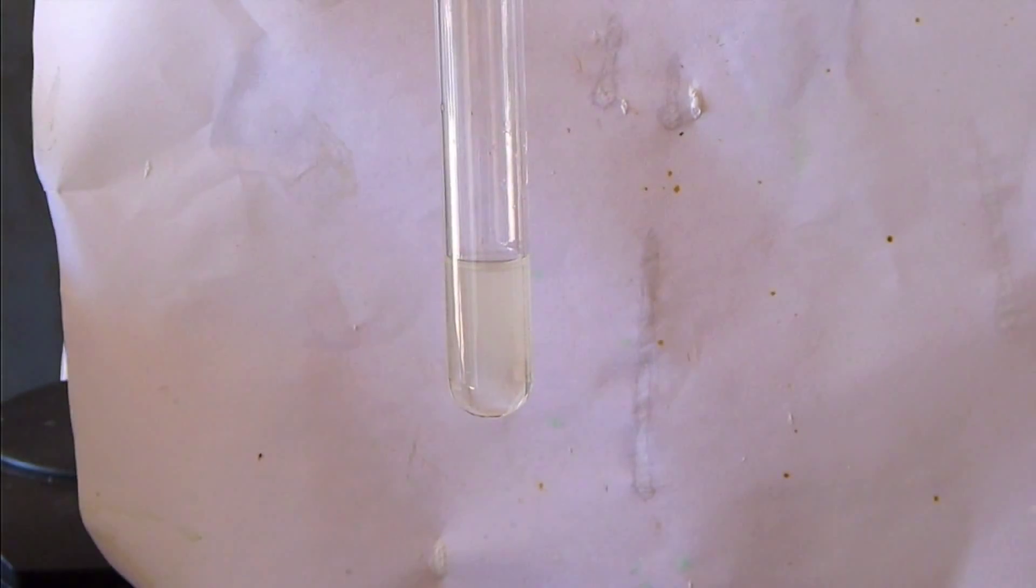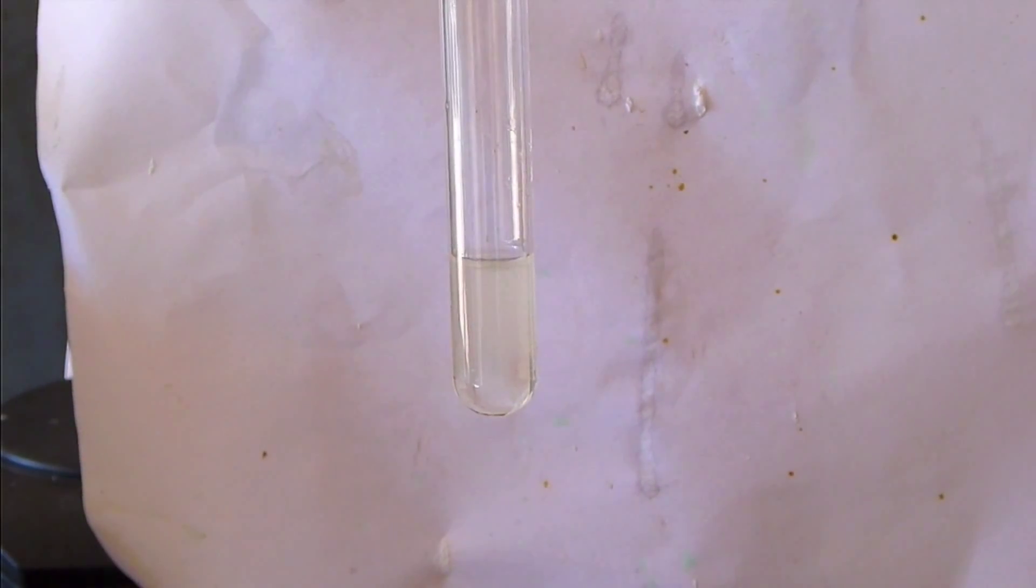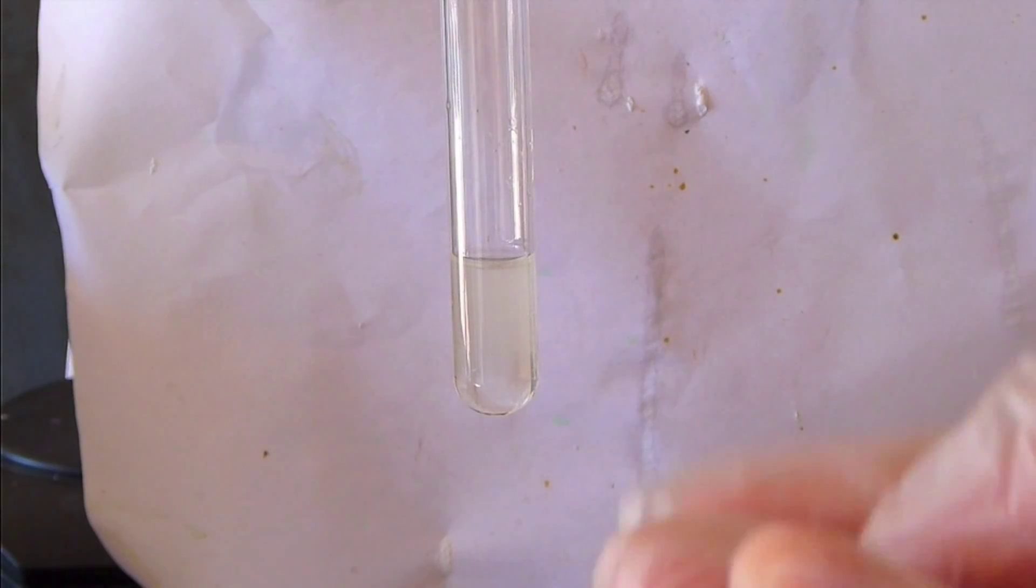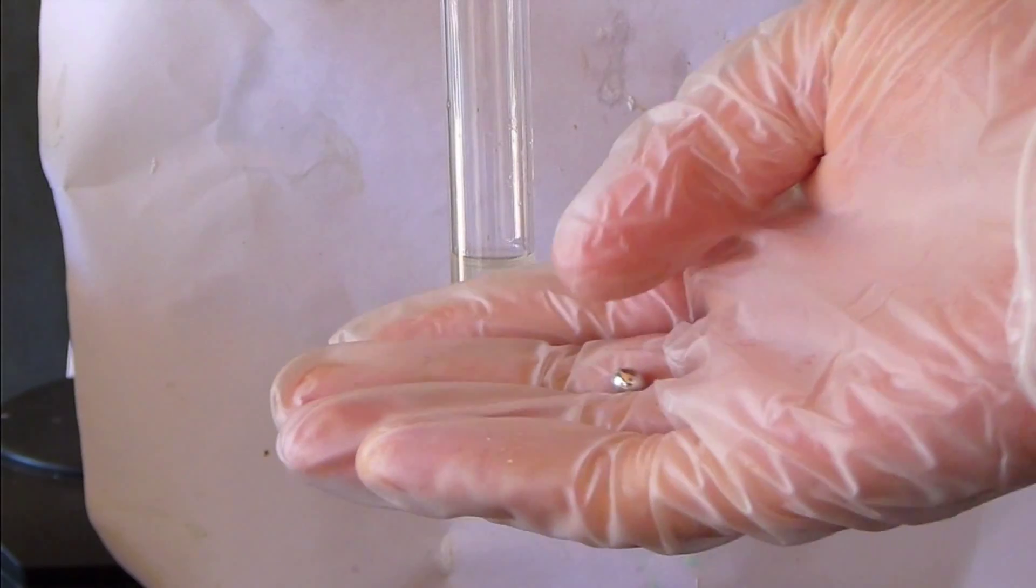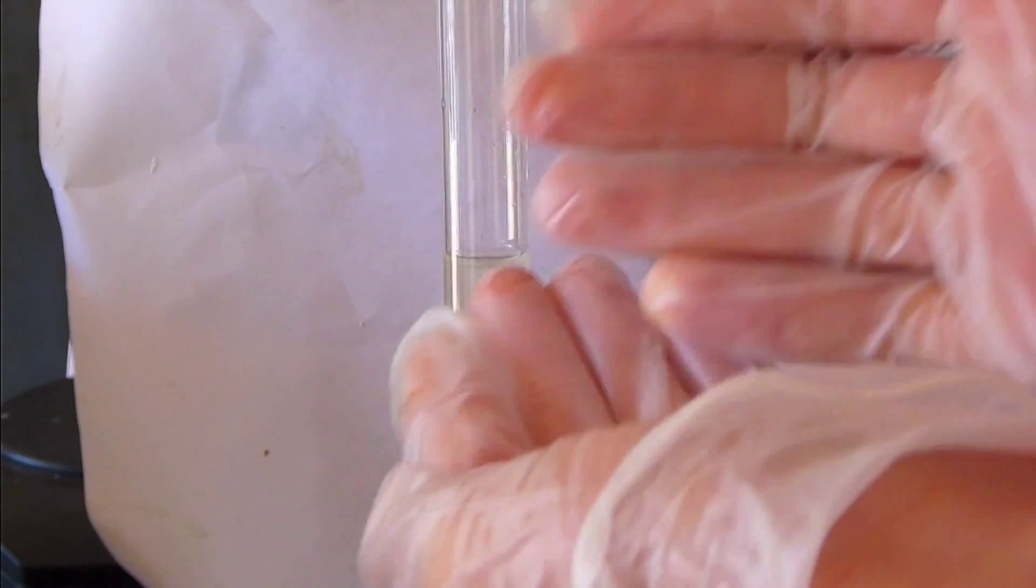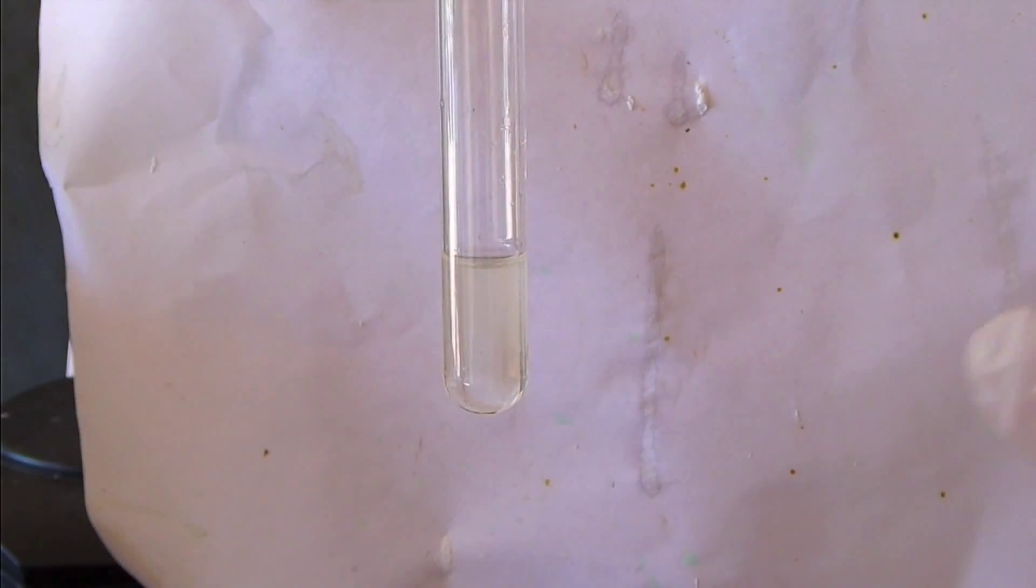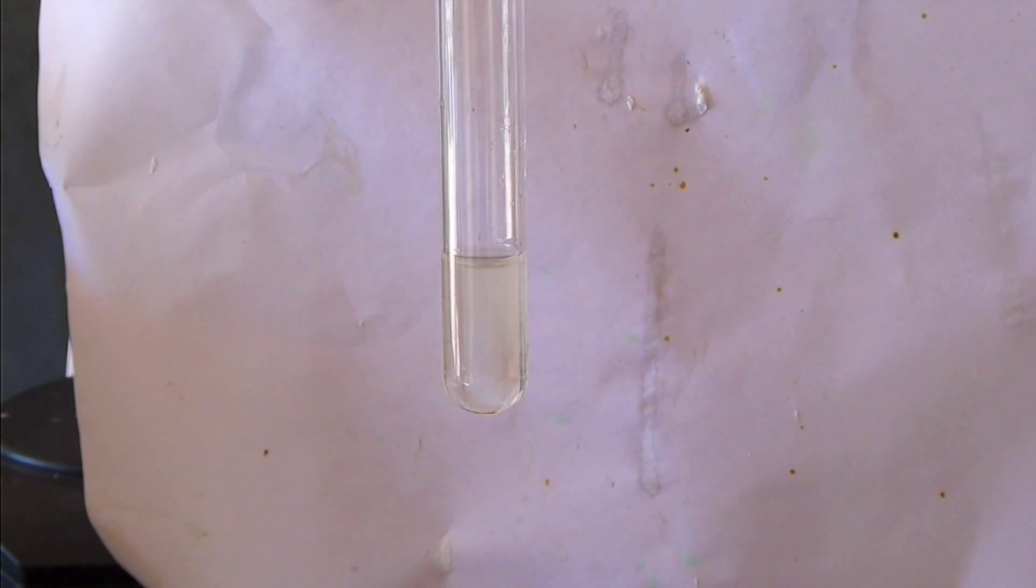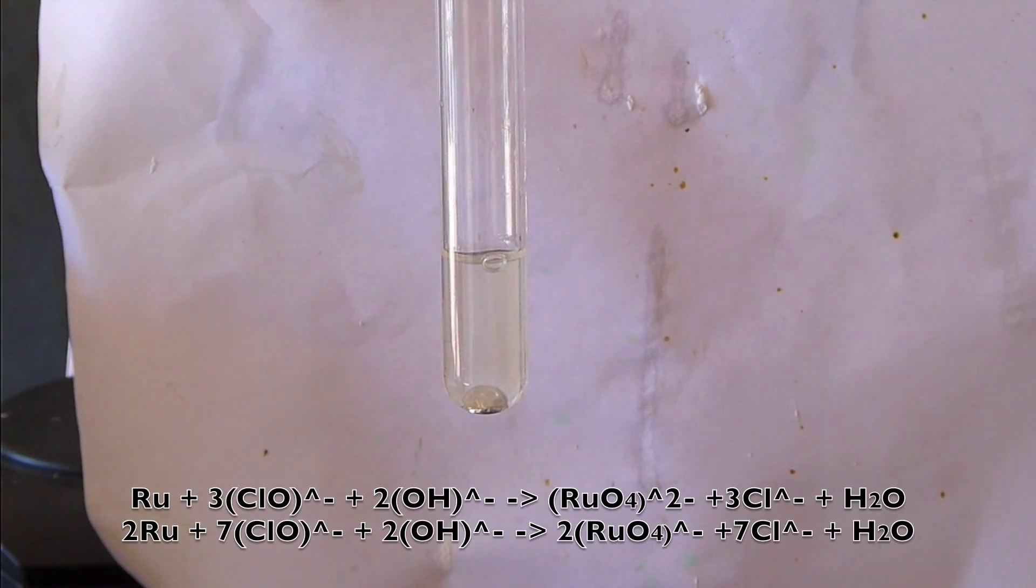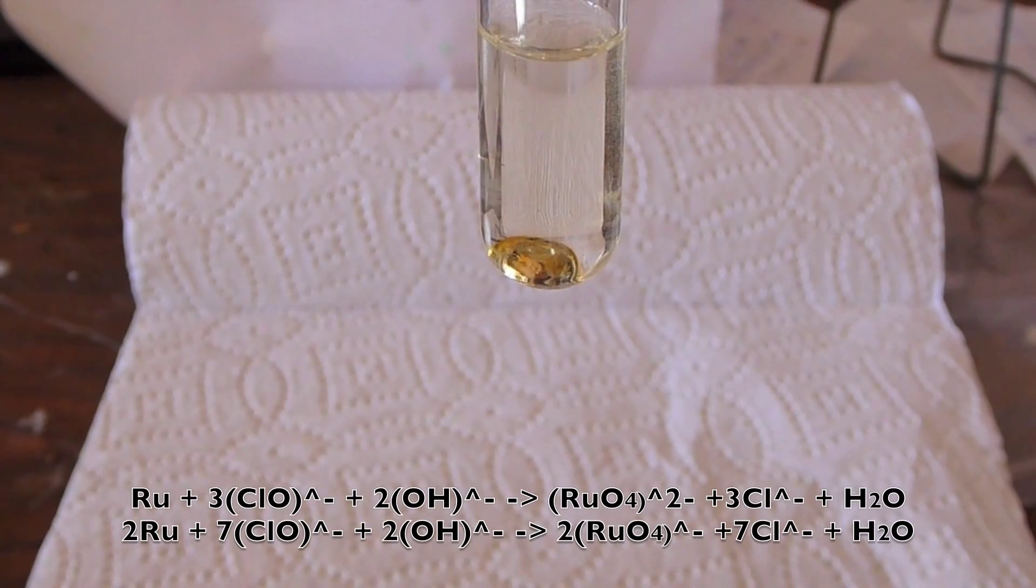My first step in doing this ruthenium experiment is getting the ruthenium into solution. This is a solution of 5% sodium hypochlorite, bleach, and sodium hydroxide, so it's alkaline. There is the ruthenium metal. You see it's a very nice bead of ruthenium. Now, I'm going to put the ruthenium into the solution, and it's going to be oxidized to the plus 6 oxidation state or the plus 7 oxidation state.